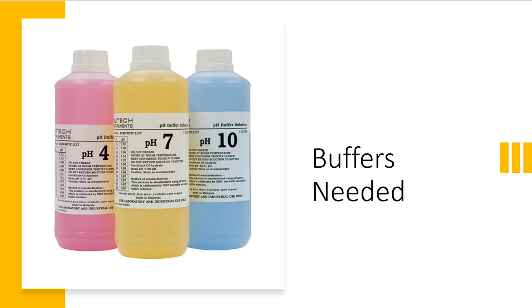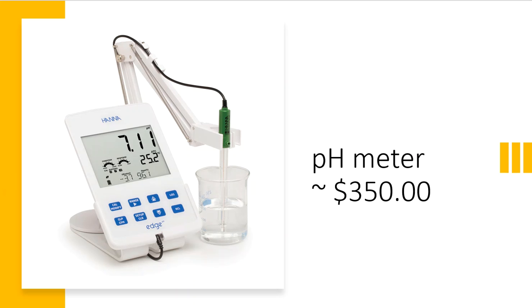All right. So what that means is that if I go and get a pH meter like this one, before I do any measurement at all with it, I will take out my buffers and I will go into a calibration section. Look, right here on the screen, very first button, you see that abbreviation CAL. That is going to stand for calibration. We do it all the time.